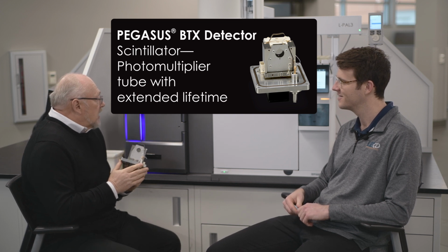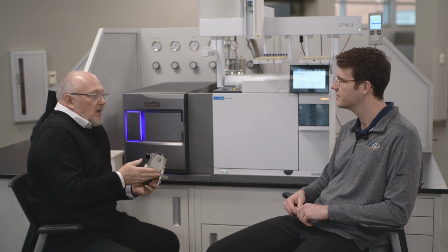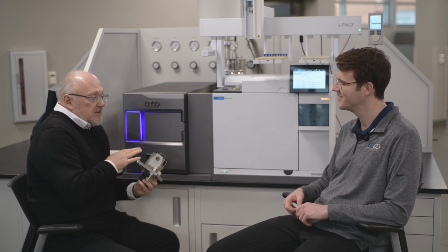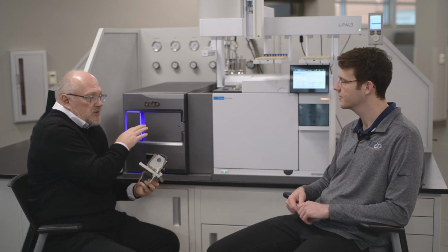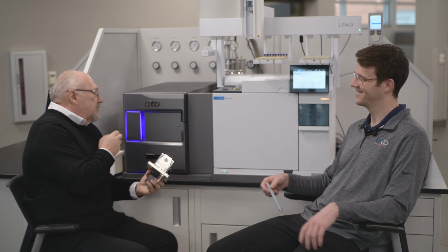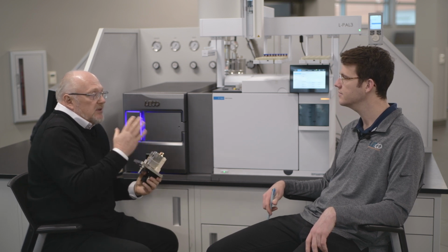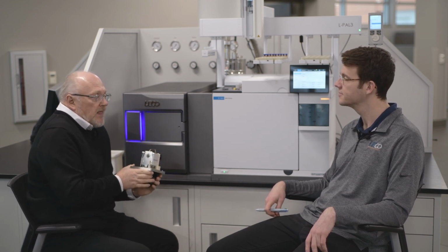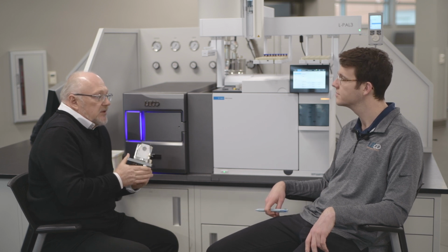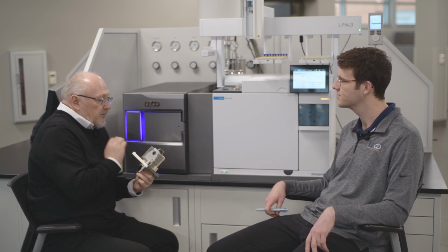Yes, of course. When the systems become much more sensitive than they used to be, that also brings high demand on the lifetime of the detectors, because all those ions we generate in the ion source, and now we generate a lot more ions than 20 years ago, will strike the detector surface and of course might cause some degradation of surfaces and shorten the lifetime of the typical detector. This is why we partnered with one of our industrial collaborators to look into a different approach to detecting ions in a time-of-flight mass spectrometer.